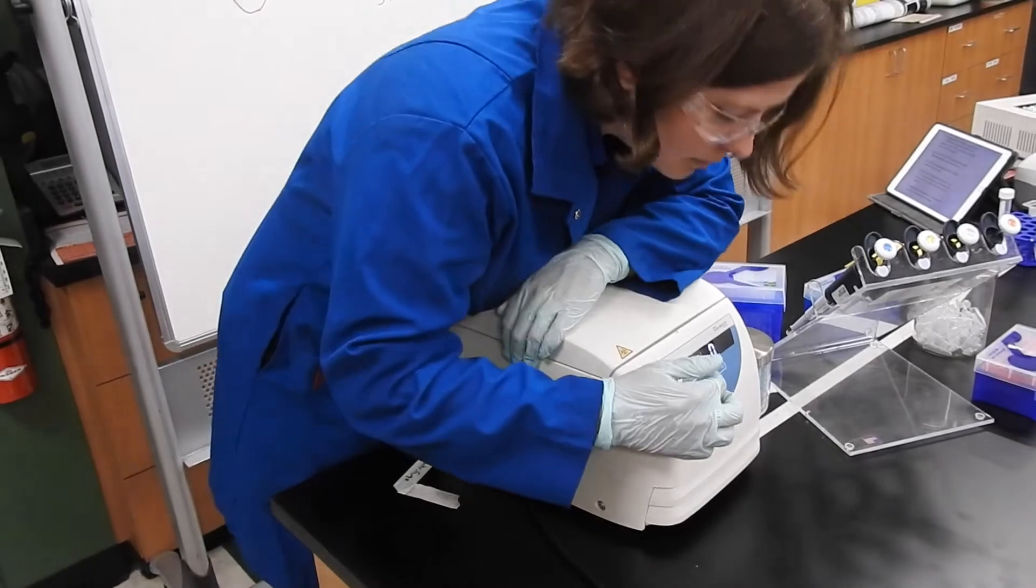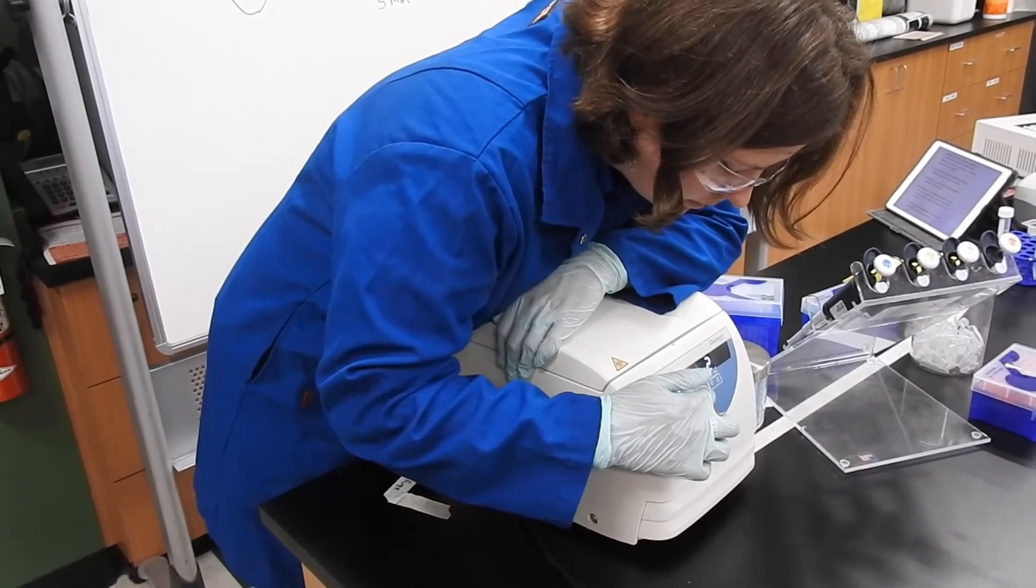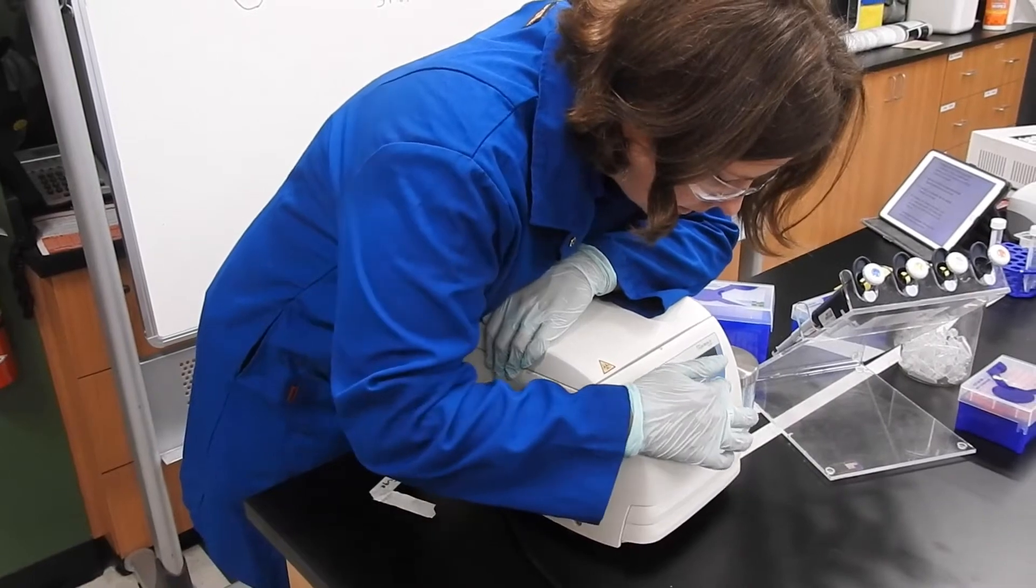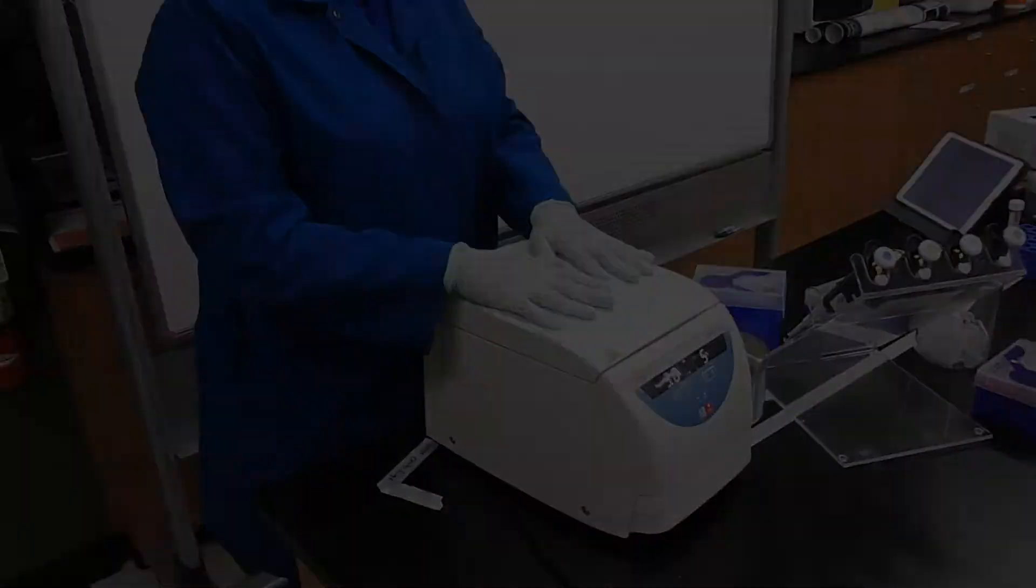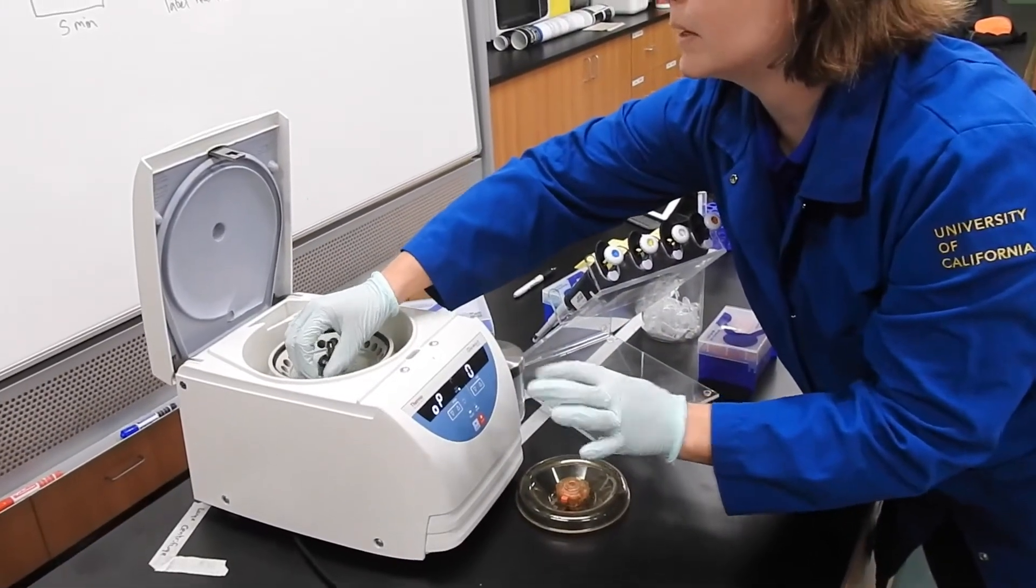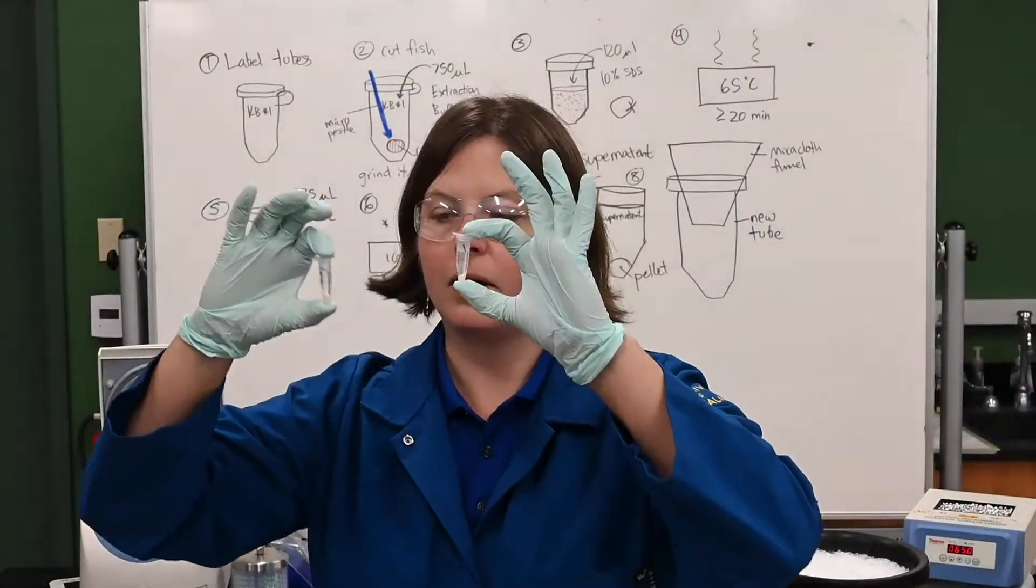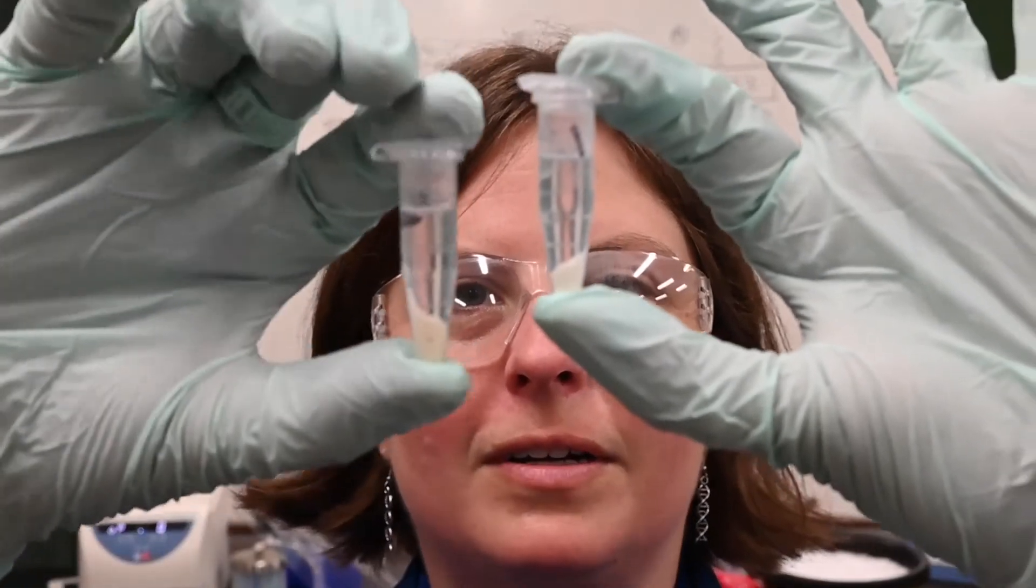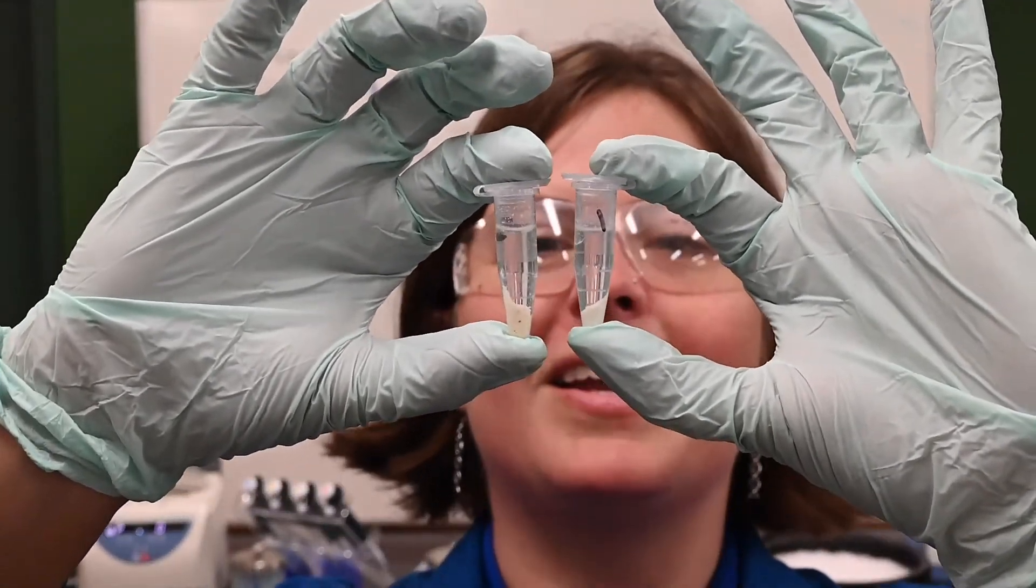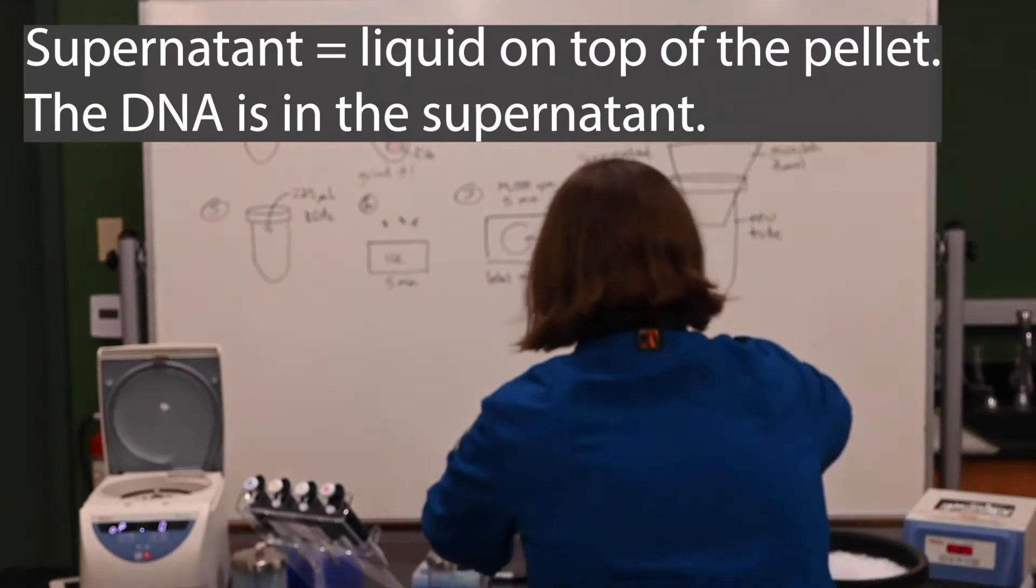All right, so lid back on. And I set this to 14,000. So you can see there's this solid white-ish gunk at the bottom. That's our pellet. So that's the protein, the lipids. And then we have our liquidy, now it looks very clear. That's our supernatant with our DNA. So awesome. Worked great. I'm going to carefully put these down before I drop them.